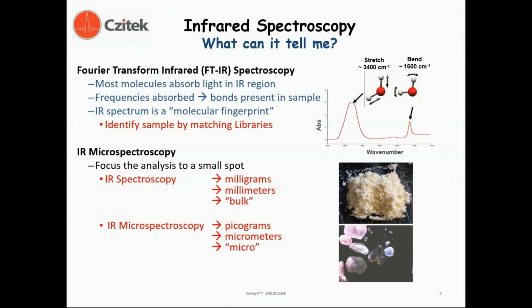So, infrared spectroscopy involves the vibration of molecules, and in this figure on the right-hand side, in the movie, we see two of the vibrational modes of water and the absorption bands in the spectrum that are due to the coupling of the infrared radiation with the electric field of the molecule as it vibrates.